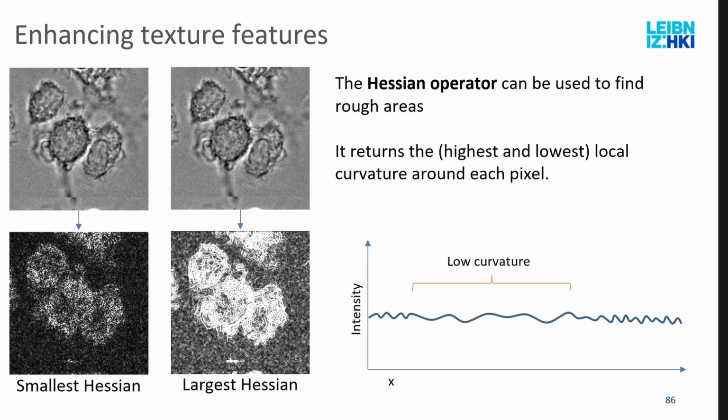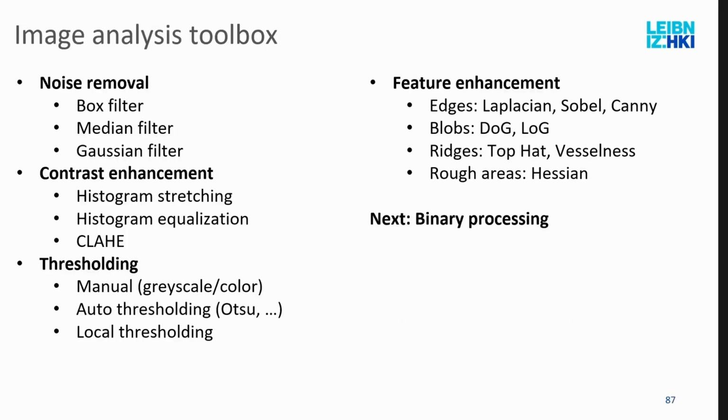You can cut them up. Although today you just throw Cellpose on that. Cellpose, so machine learning, deep learning will do this for you. You give it an average size, and then it will find the cells for you. Although sometimes you have to train it, which JIPipe can do, and I don't know if Saturn will show it for you, but it's possible.